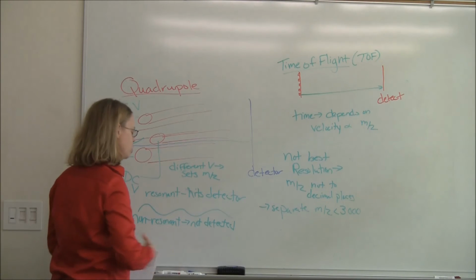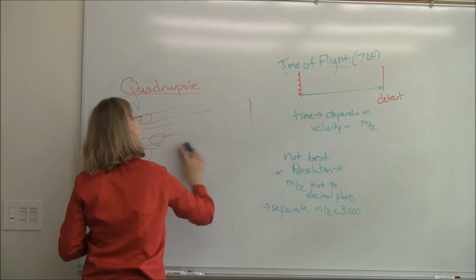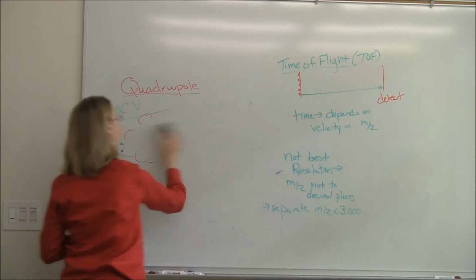All right, so there's a new type of instrument that's coming around that we don't have in our lab, but I want you to kind of hear about. What's the future of mass spectrometry, or it's really the now?